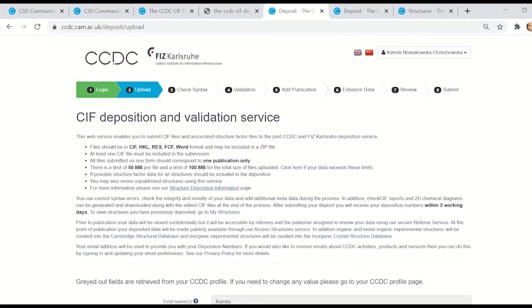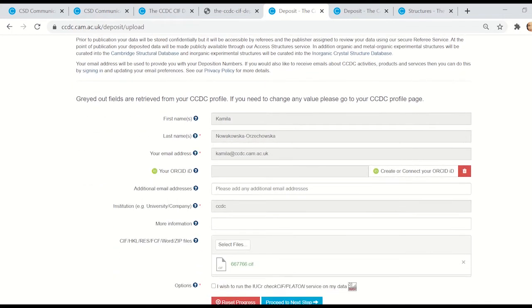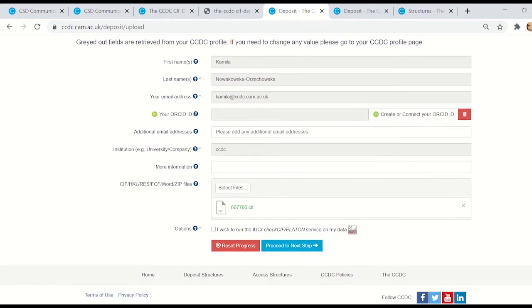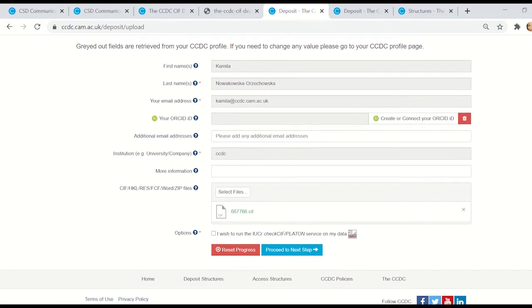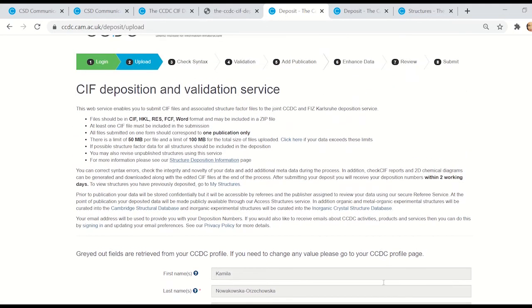The deposition of CSD Communications data can be a part of the normal deposition process. You can check the integrity and uniqueness of the data through tools such as checkCIF or our reduced cell check, which are available as part of the online deposition. For the full deposition process, please see our video on how to deposit data, linked in the comments section below.